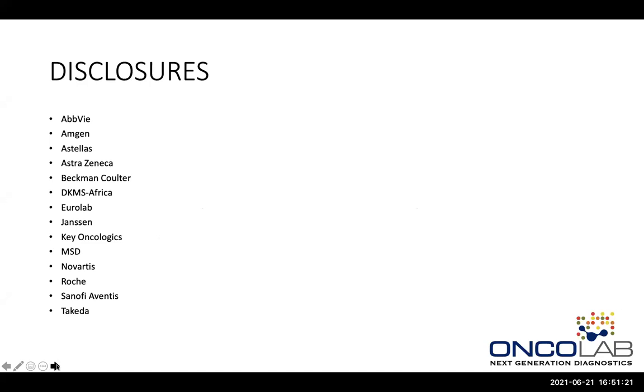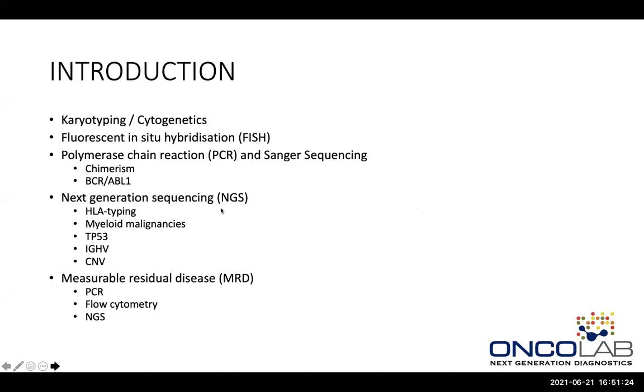So, just some disclosures that I did consulting for. Okay, so I'm going to talk about karyotyping, cytogenetics, FISH, PCR only a little bit, because I know far less about that than Karen. Then next-gen sequencing, where I'm taking a lot of my colleague Robin Marshall's work and reporting on that. And then MRD, which is one of my passions.